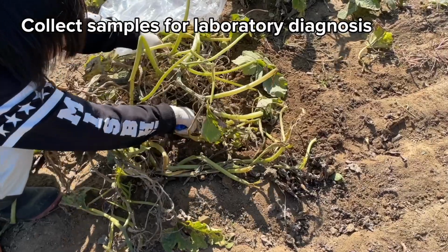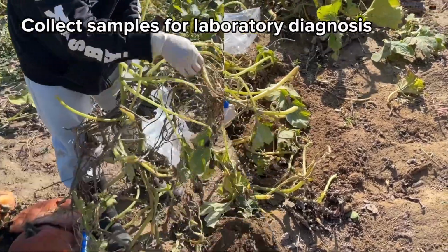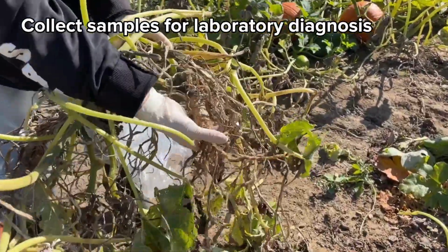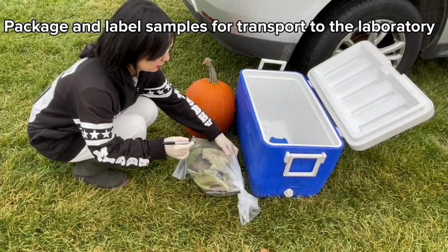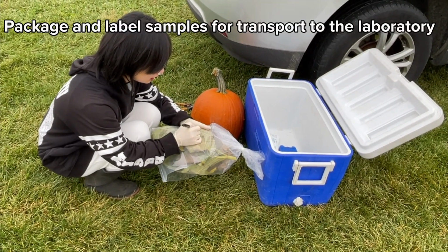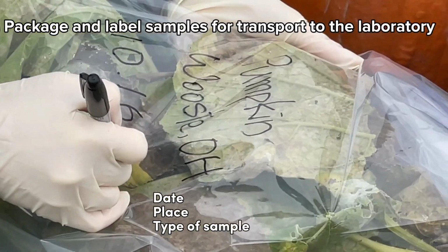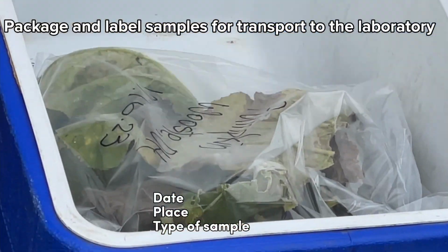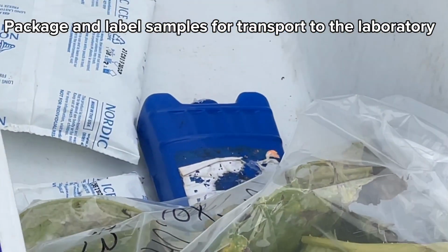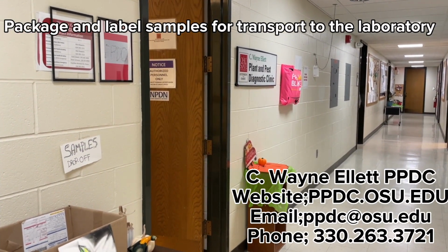When you are doing whole plant sampling, dig around the plant and be careful not to damage the root, because pathogens can be present in the root. After sampling is done, label the bag with the date, place, and type of sample. Put samples in the cooler with an ice pack to keep them cool and fresh. After that, transport them to the laboratory.